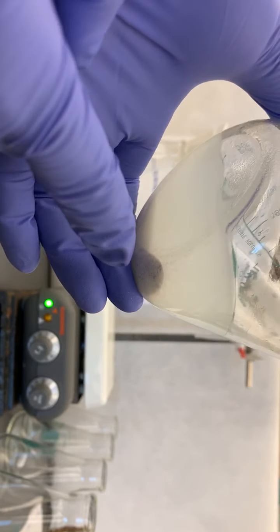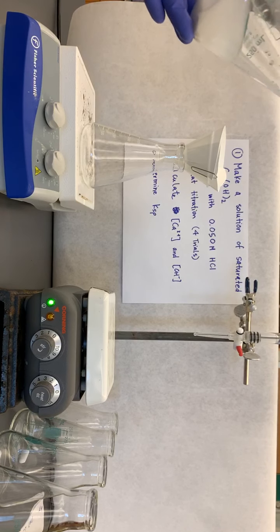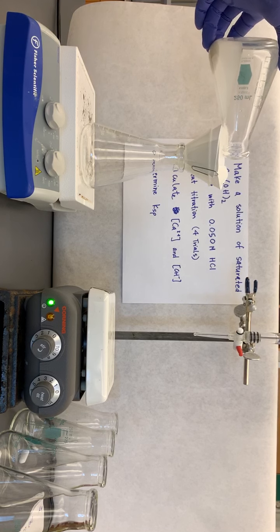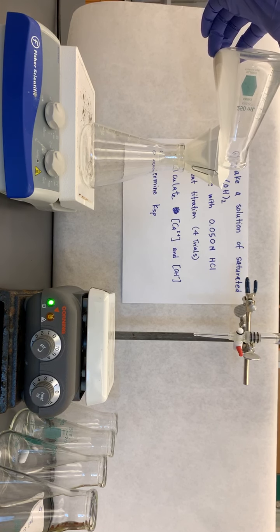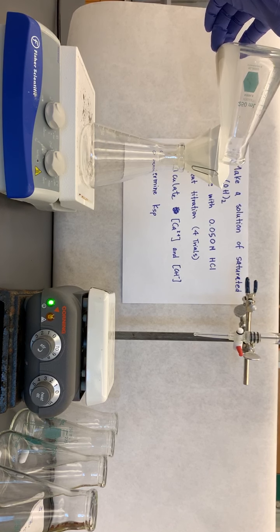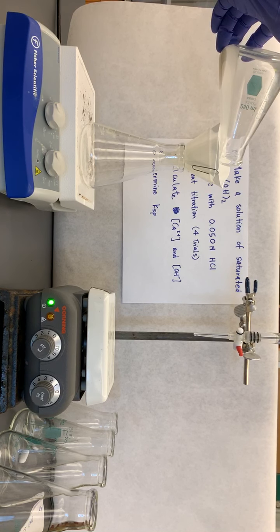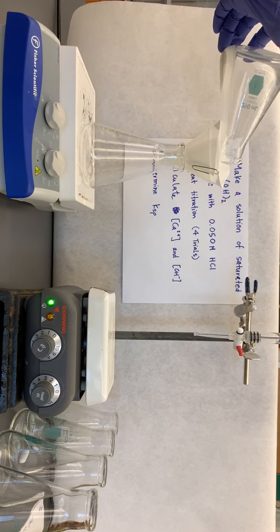So I'm going to let it settle a little bit. I don't want the precipitate, I just want the saturated solution to titrate with. So I'm going to let it settle a bit, and then I'm just going to decant. Decant means to pour over the liquid and leave the solid behind. That's exactly what I'm going to do. I'm going to try as much as possible to leave the solid behind, because I don't need it, and if I pour it over, it's going to clog up my filter. So I'm going to gently pour that into my filter.